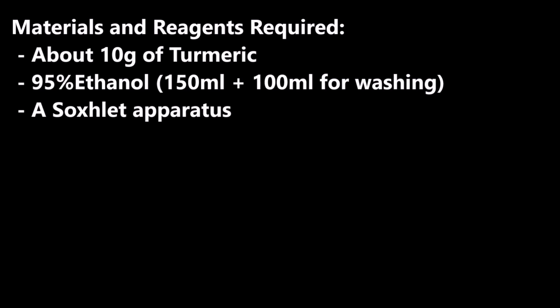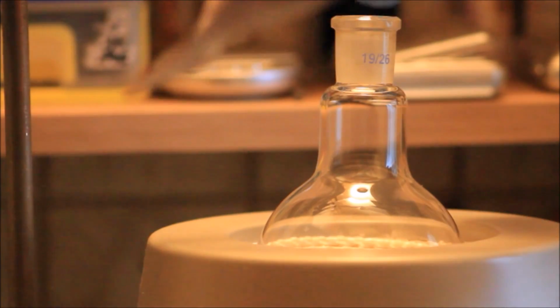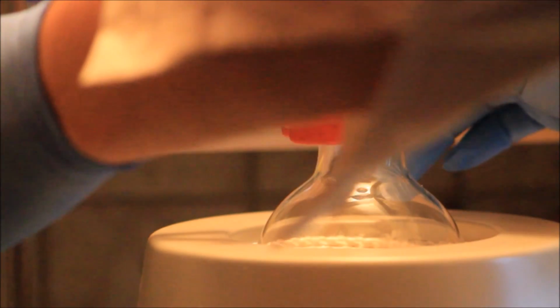Materials and reagents required: about 10 grams of turmeric, 95% ethanol, 150 milliliters plus 100 milliliters for washing, and a Soxhlet apparatus. First, a round bottom flask is placed and secured into the heating mantle.